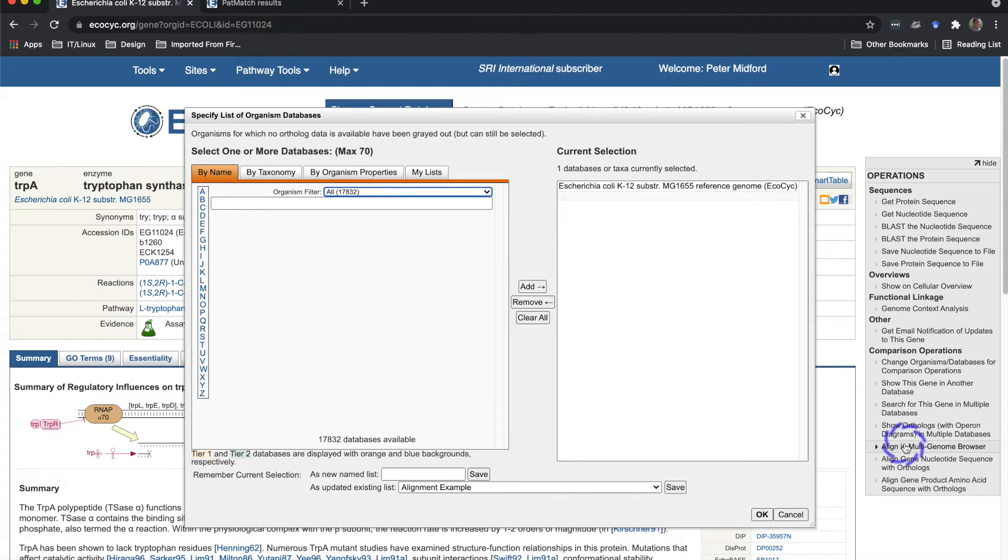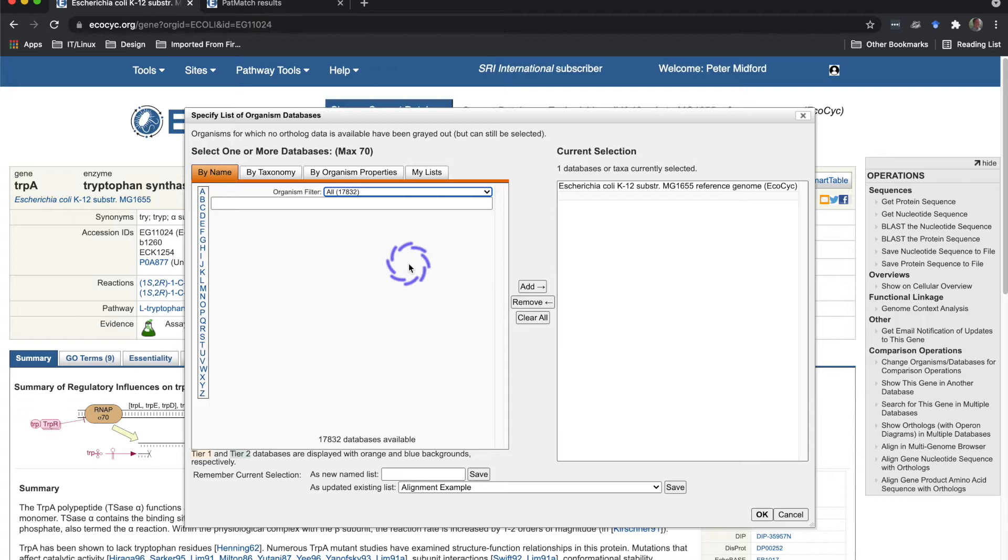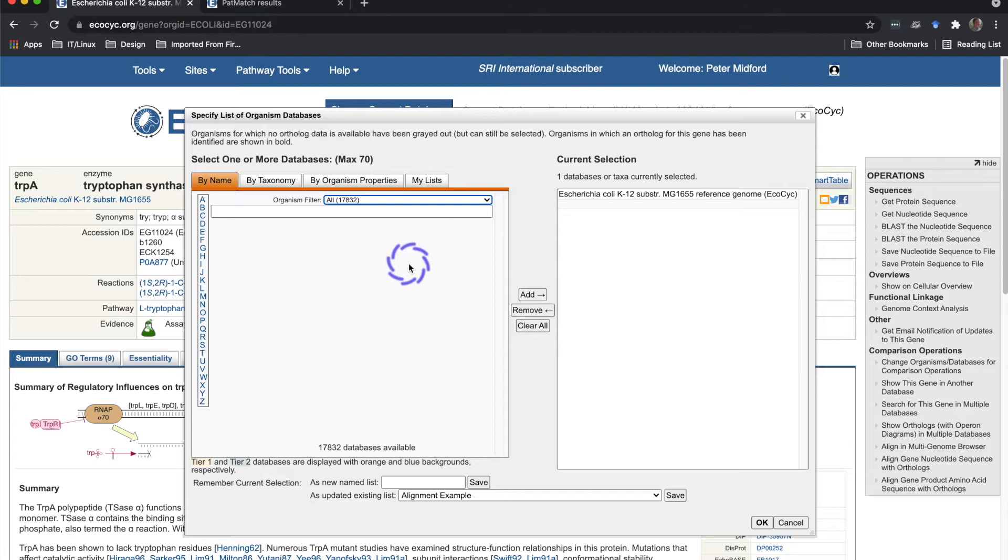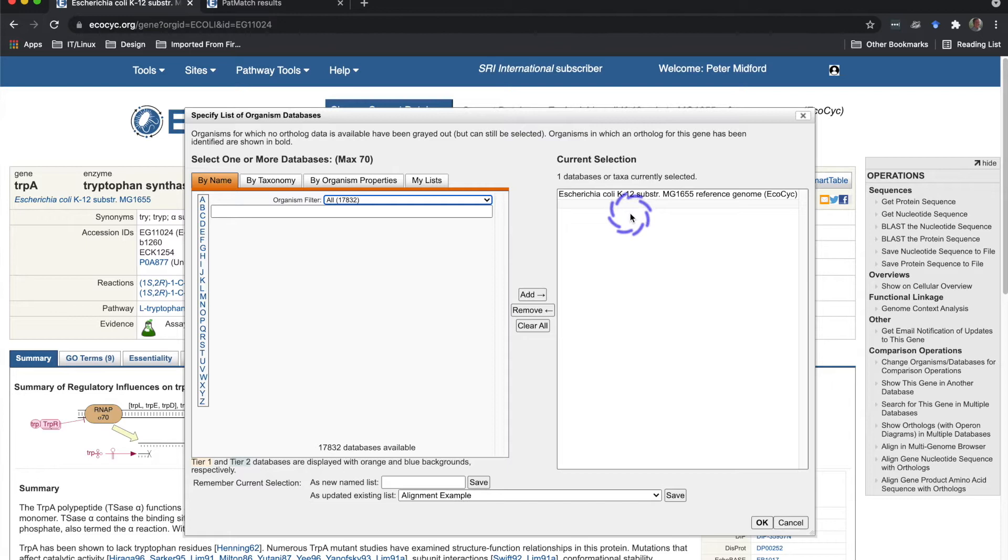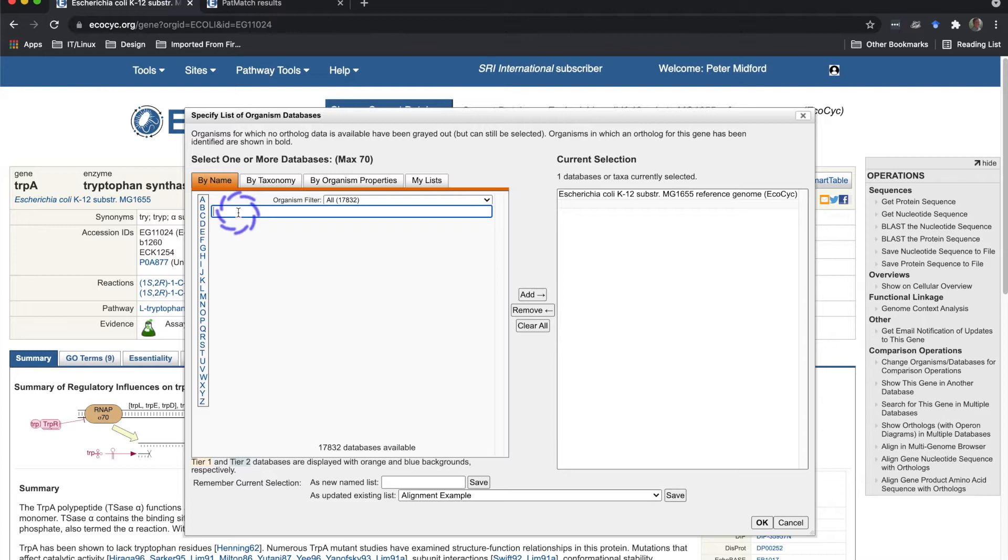This brings up a dialogue with two lists of organism databases. The one on the left is similar to the chooser for the main choose organism database command on the top of every page. The one on the right is a list of organisms that you want to compare. Notice that the list on the right starts with the current organism, in this case E. coli K12 MG 1655. I use the chooser on the left to add a few organisms. For each organism, I enter a portion of the name and select the organism from the list of completions.